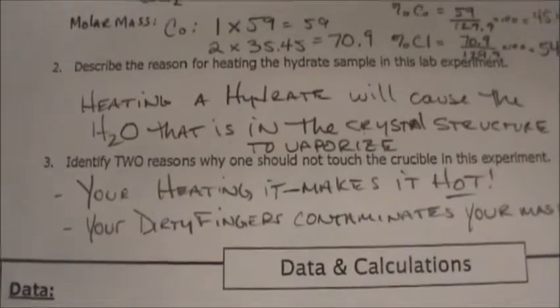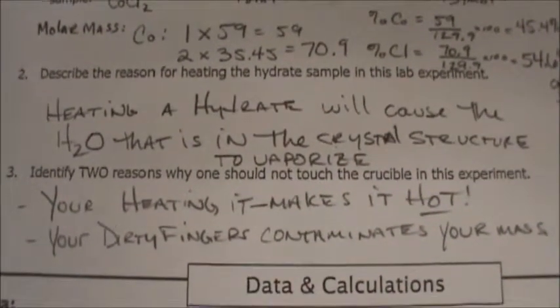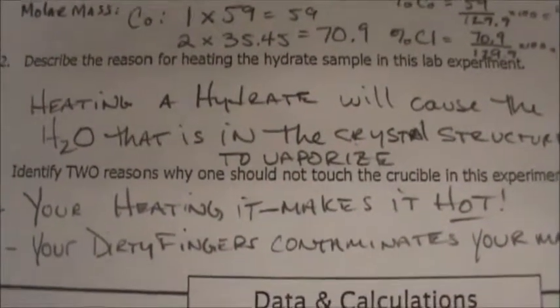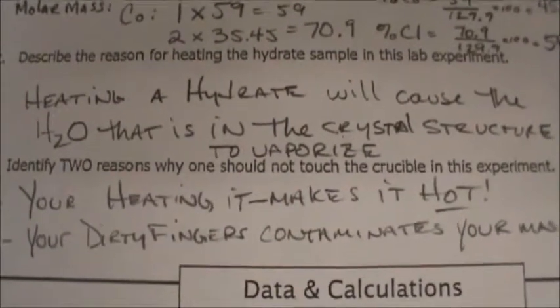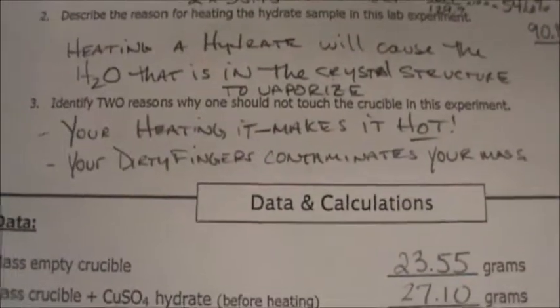The other 2 questions were written. It's asking what heating a hydrate will do, and what the reason for doing this lab is. It's because we want to drive off the water that's trapped in the crystalline structure of this hydrate. So heating it will cause the water to vaporize. That's what I said.